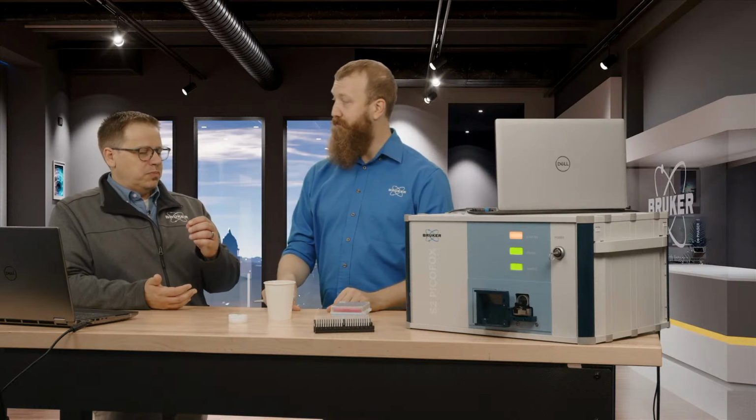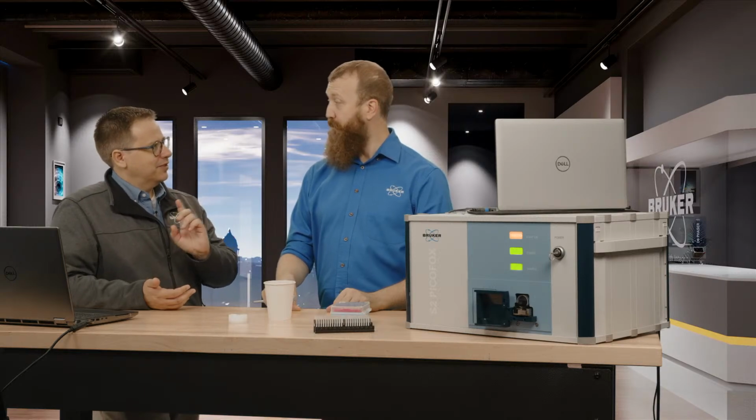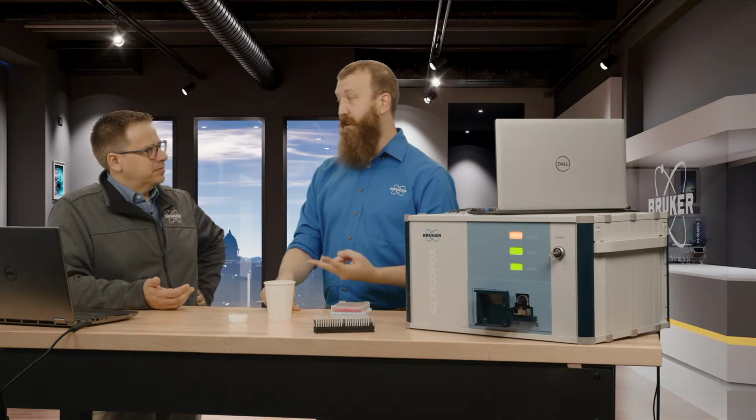So if you wanted to boost the concentration of, say, heavy elements, would you ever put it into one of those, I don't know, what's the name of the spinning thing? Centrifuge? Yes, a centrifuge. You can play around with sample preparation methods like that. In fact, it's usually the other way around.